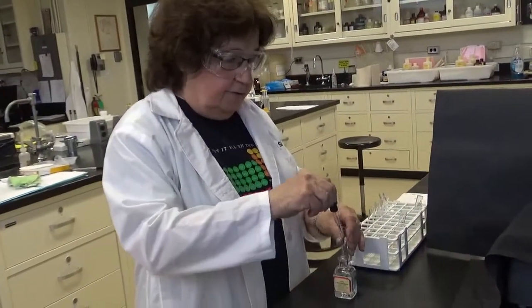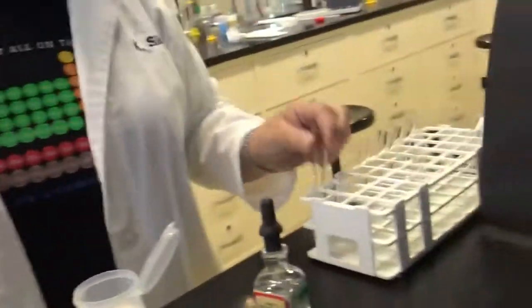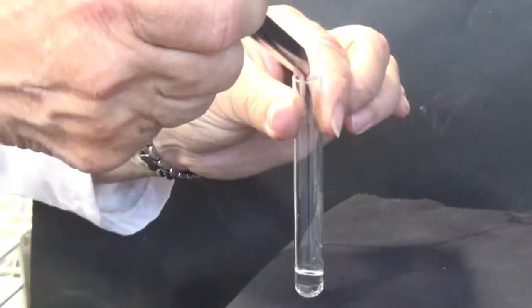Now you'll notice the first section says no need to fill this box because cyclohexane plus cyclohexane would be cyclohexane. So there's nothing to see. Let's see what happens with the box just below it. Sodium chloride. So I'm going to get some sodium chloride, and I am going to take a tiny bit because I just want to show us adding a little bit. Let's see what we see.